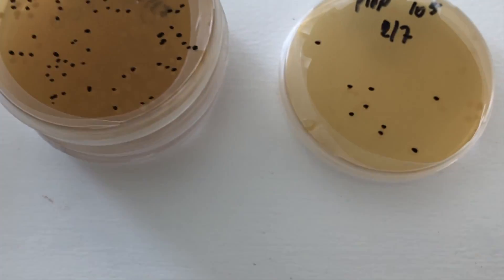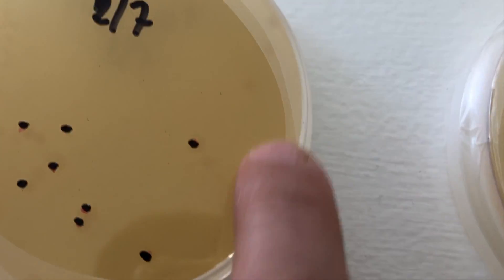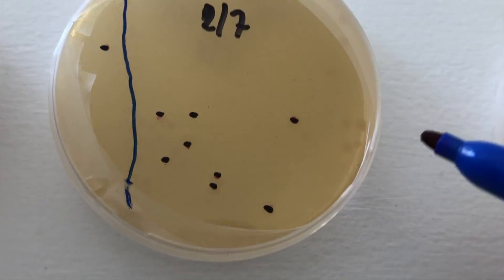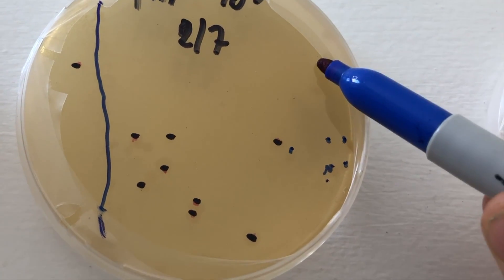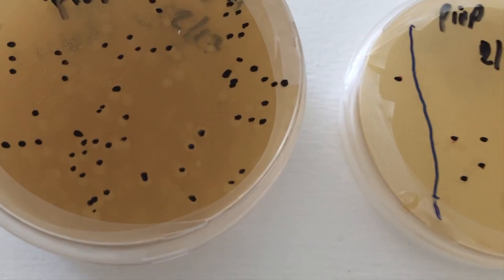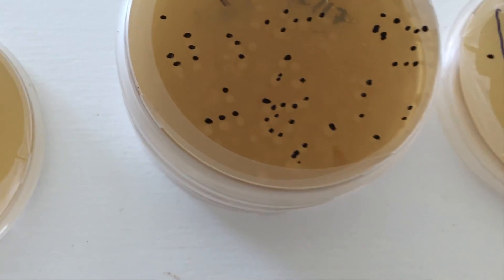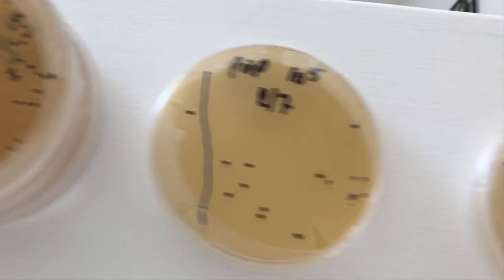Now we're getting to some of the dirtier stuff from yesterday. You can see that there's quite a bit of bacteria coming to life right along this edge on the 10 to the 5th, so I'm just gonna partition off this side from the bacteria. There's still some clean sections right in here that hopefully we'll get some spores popping soon. But over at the 10 to the 4th, more concentrated, these ones are possibly goners. But that's why we dilute, and we also streaked out, so we've got two hopeful plates still for the piapino.